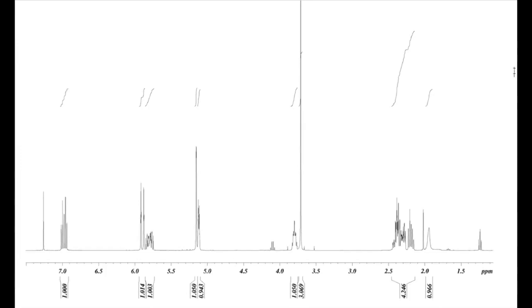Right then, so let's see how this method gets used in practice. This is a proton spectrum for a molecule that I made during my PhD. The molecule I made was this one, which of course is a secondary alcohol, which has a stereocentre. So I made this as a single enantiomer, or really very, very high EE. And I want to show you how you can prove the absolute configuration of that stereocentre just using NMR spectra alone.